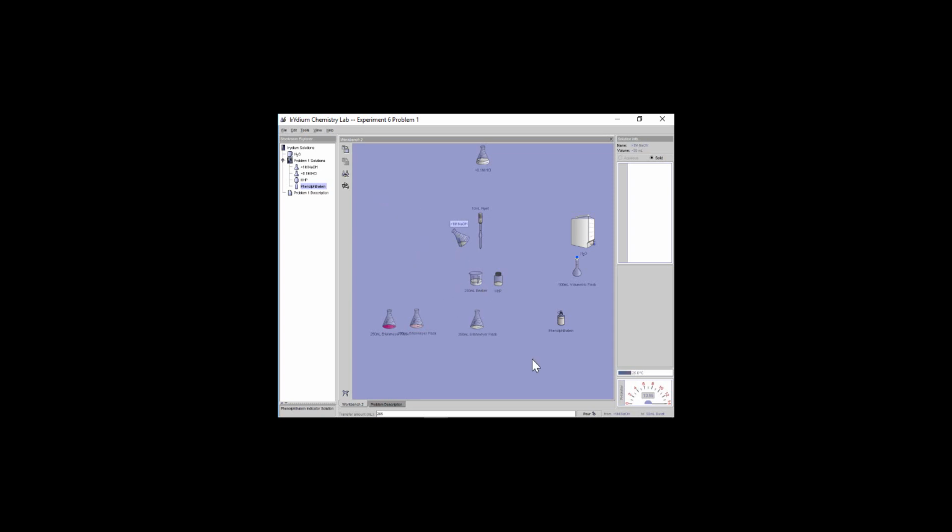So totally, if you're not in a titration, you can reload all you want. And you can pull out a fresh burette. That's fine. This time I'm going to pull in NaOH. Let's pour in 35. So something totally different. You just want to make sure you have enough inside this burette for one titration so you're not reloading mid-titration. So in this case, I was worried I didn't have enough, so I take a new starting reading. I now look like I am at 22.82, give or take, plus or minus 0.05.